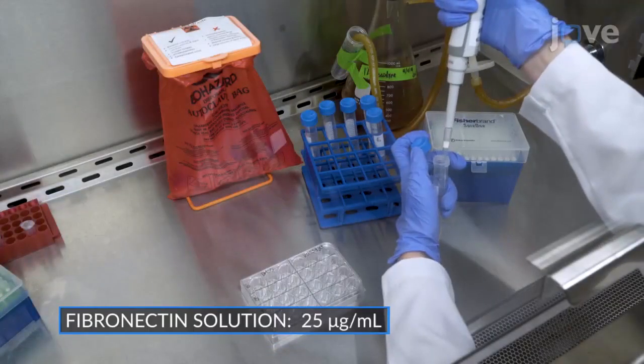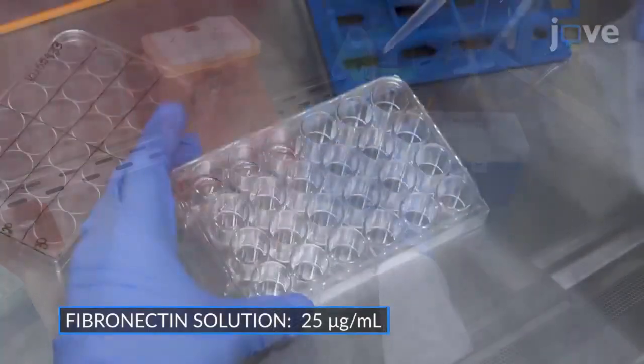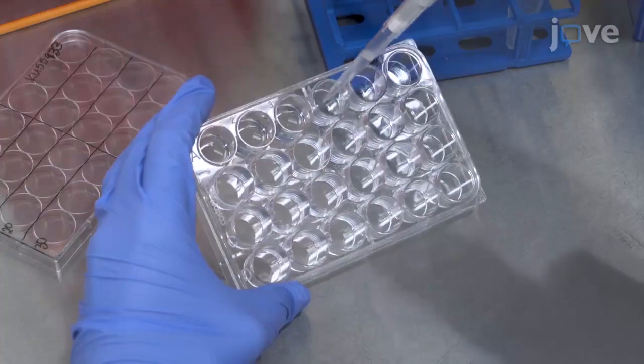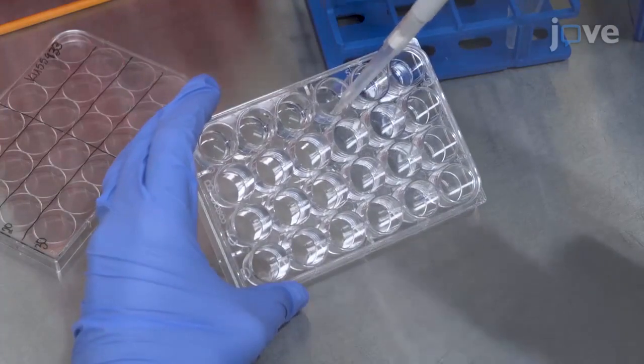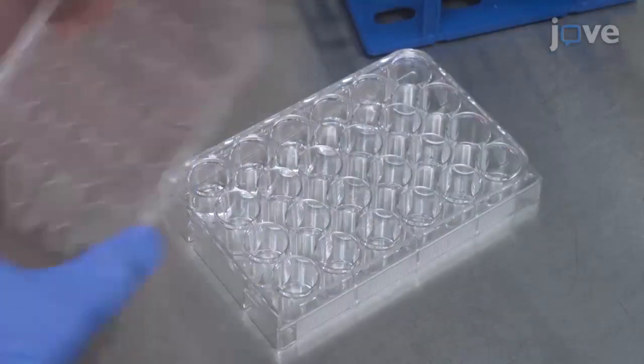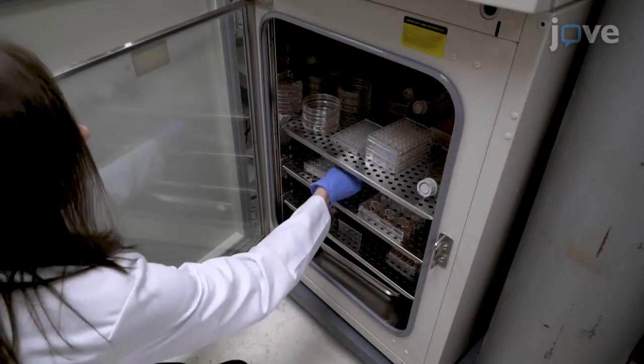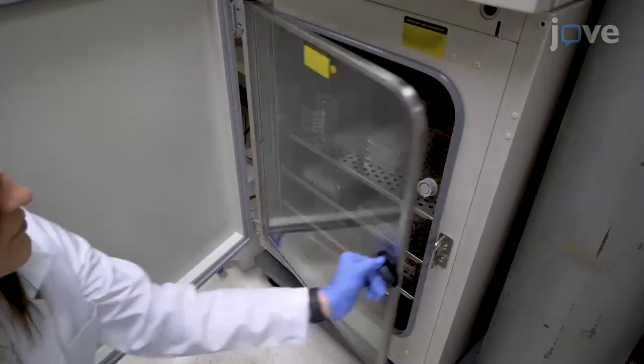Next, pipette 500 µL of the fibronectin solution into each well. Pipette the solution over each coverslip a few times to ensure an even coating and complete submersion. Cover the plate with the lid and incubate at 37 degrees Celsius with 5% carbon dioxide for 1 hour.